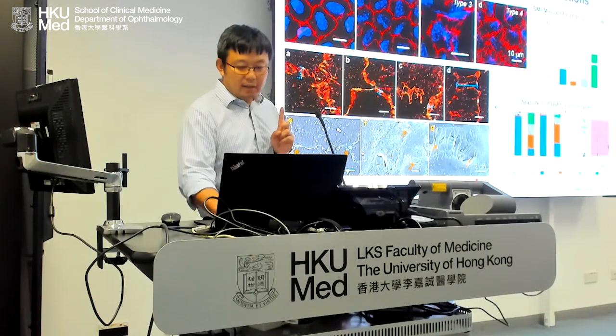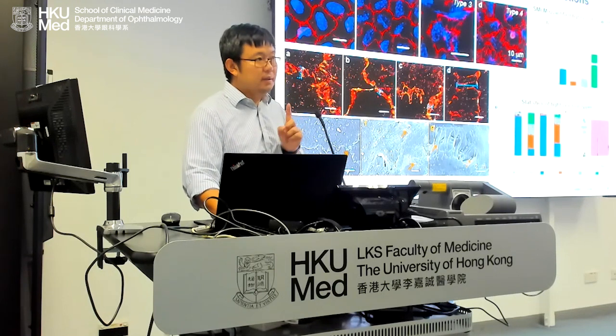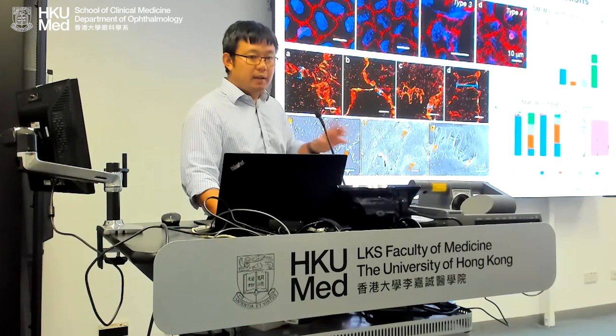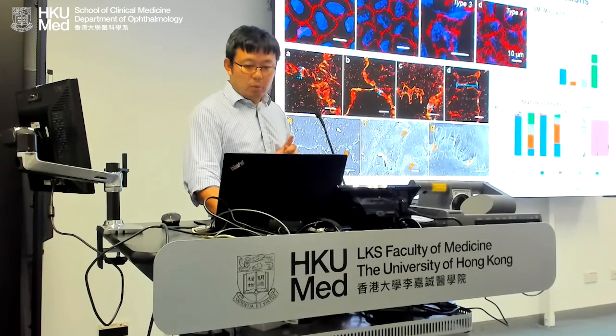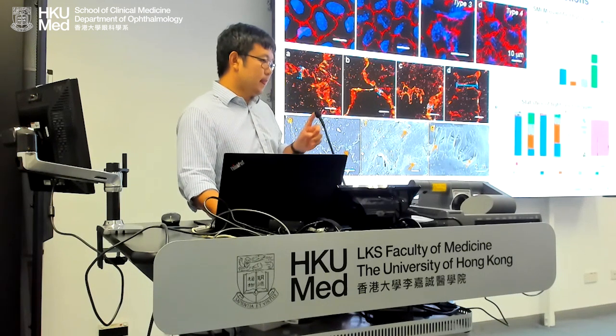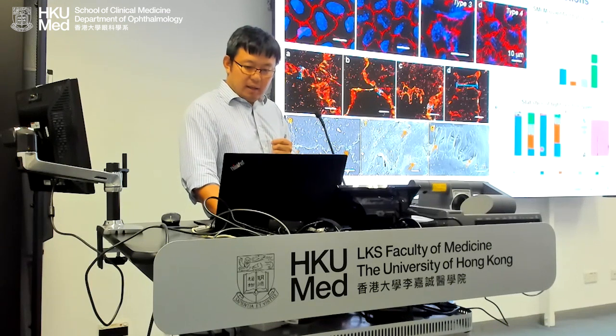And look at that. Because the confocal microscopy has a large field of view and is defined by the super resolution microscopy, we can do a statistical analysis. C1 means control normal pressure. C2 means control high pressure. C3 means ROCK normal pressure. C4 means ROCK high pressure. And these are the 4 types of tight junctions.